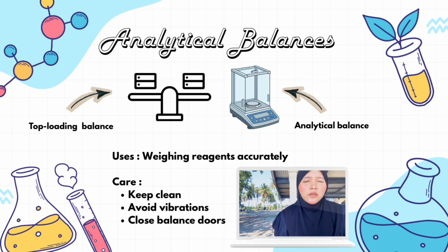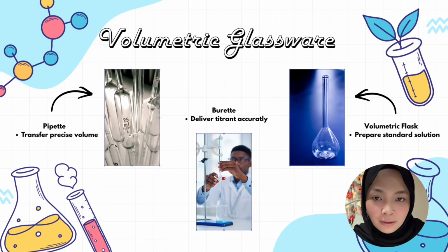obtain accurate measurements. Hi everyone, my name is Nur Amana Batrisha and I will be presenting on volumetric glassware. This slide shows the main types of volumetric glassware used in volumetric analysis and acid-base titration. Volumetric glassware refers to laboratory glassware designed to measure and transfer liquid accurately.